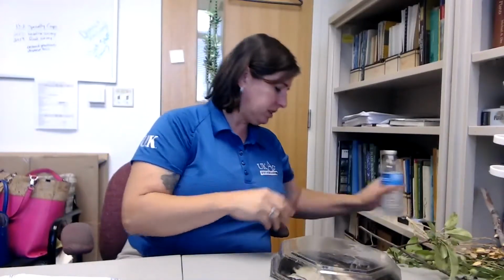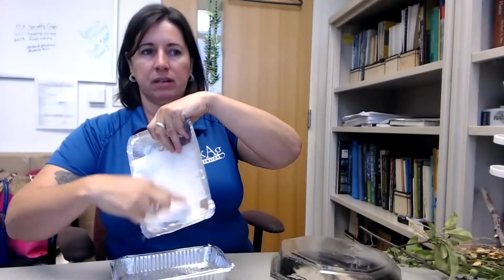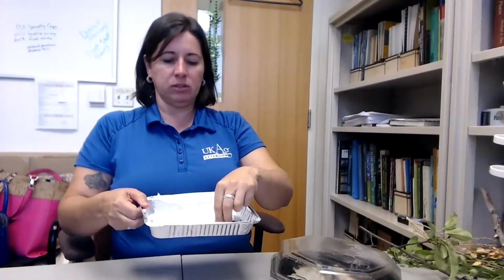Very important is that you squeeze that out. So what I like to do is squeeze the water out and pour it out, so you've only dampened the paper towel, okay? If you've got a sensitive leaf, then you might want to put ink pens or pencils, toothpicks, whatever you want, down there and suspend a leaf on top of that so it's not touching the wet paper towel. It's kind of glary here. I don't know if you can see. There's my wet paper towel.